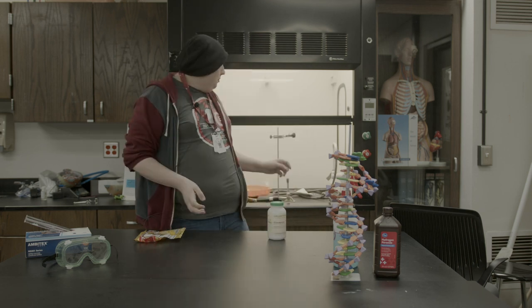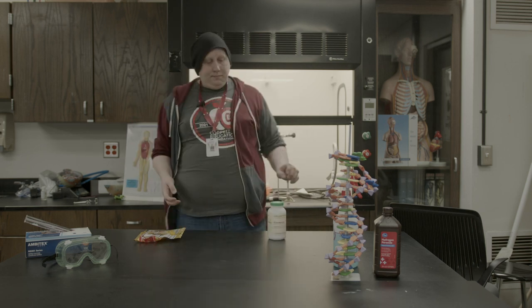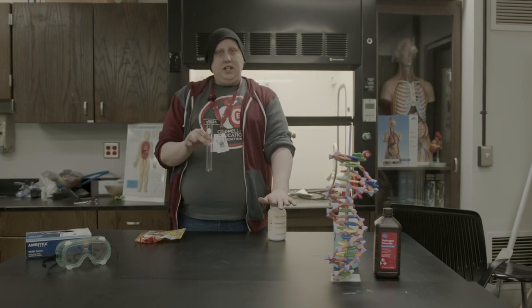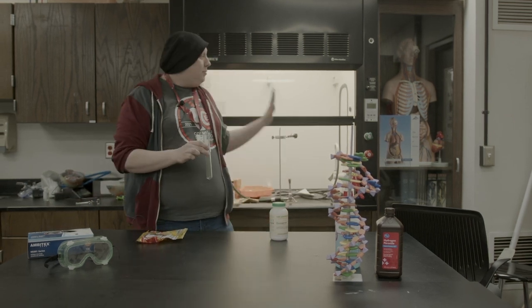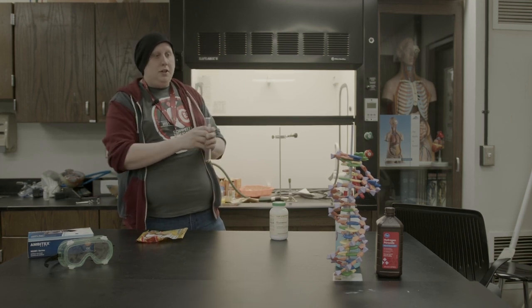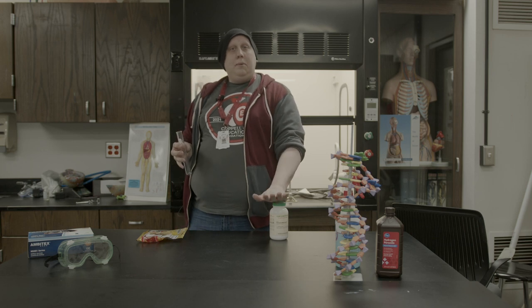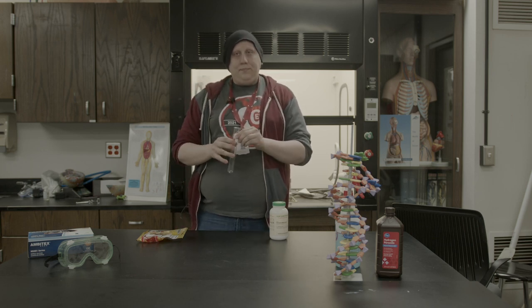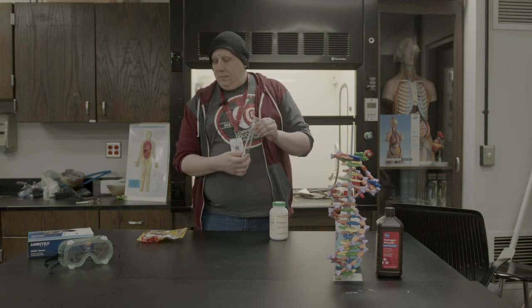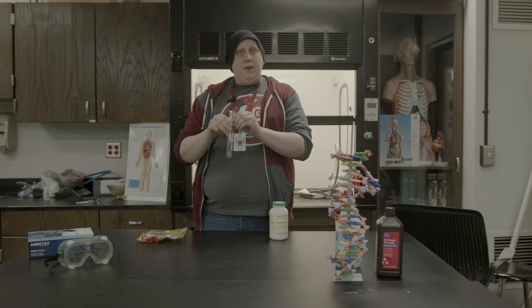Now, what we're gonna do is we're going to put some of this potassium nitrate into this test tube. For safety reasons, we're gonna do this inside the fume hood so that we don't breathe in the gummy bear's ghosts. I'm gonna put some potassium nitrate in here, and some water to get the ions freed up, single, ready to mingle with our gummy bear. So let's get started.